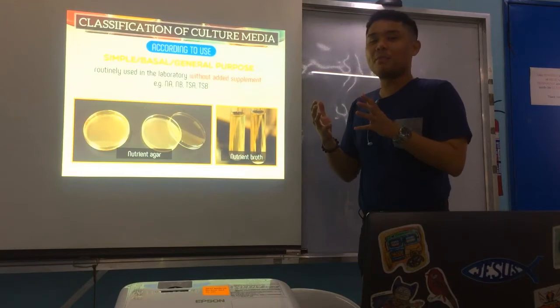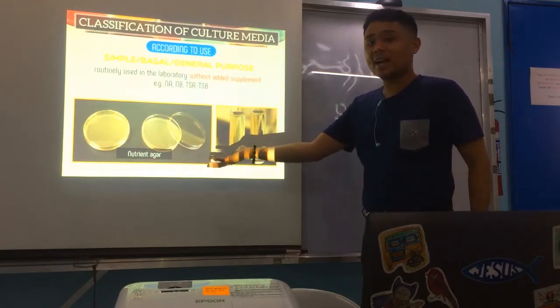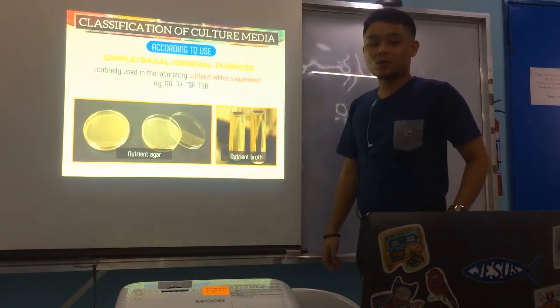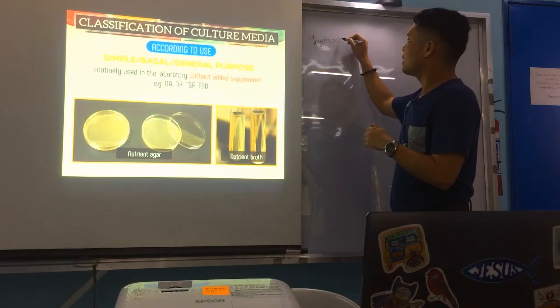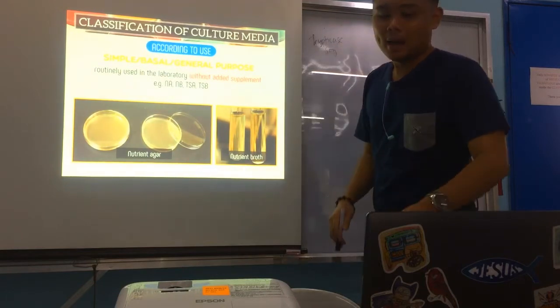So, there is no added supplement. It's just plain agar, usually. And a very good example is you have nutrient agar and nutrient broth. Aside from that, you have TSA and TSB. Trypticase soy agar, trypticase soy broth.